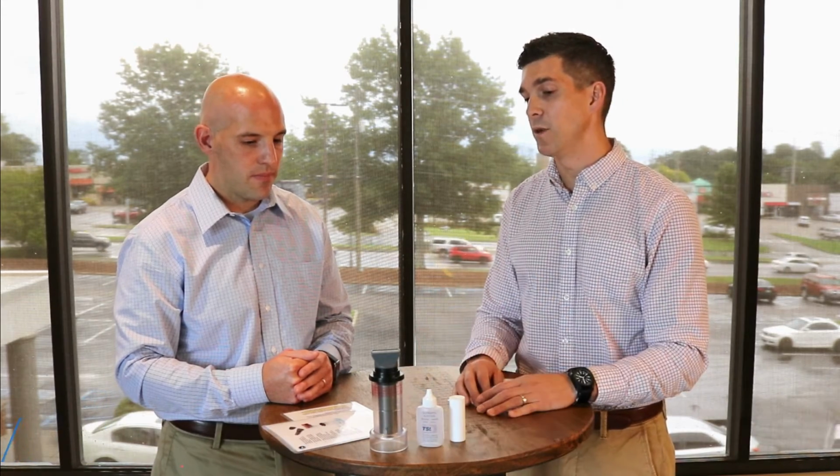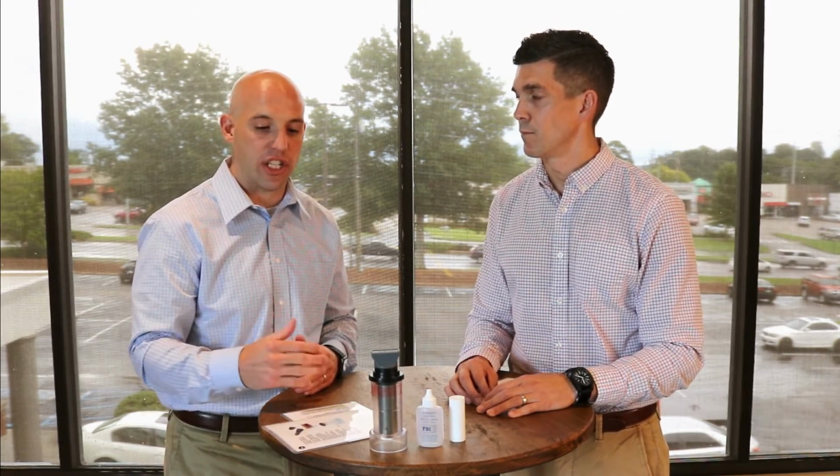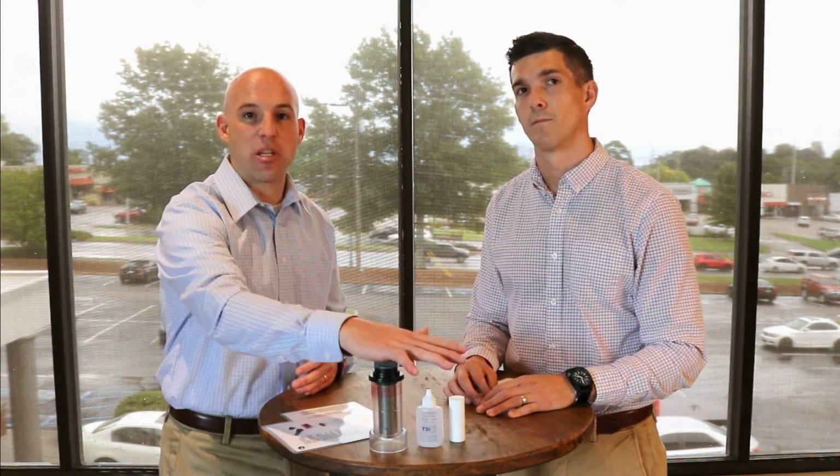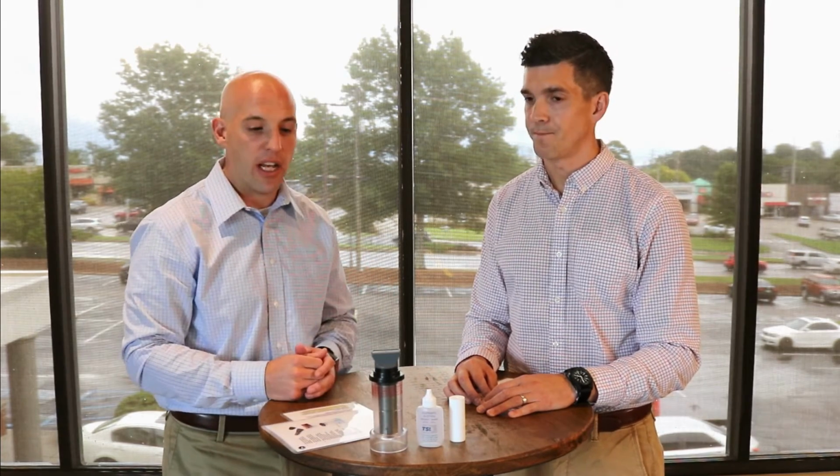So the first consumable is you have to have something to coat the particles. So Booth, what does that lead us to with the isopropyl alcohol? Yep, absolutely. So when challenging a respirator with ambient aerosol technology, you have to have isopropyl alcohol to coat the particles so they can be effectively counted.